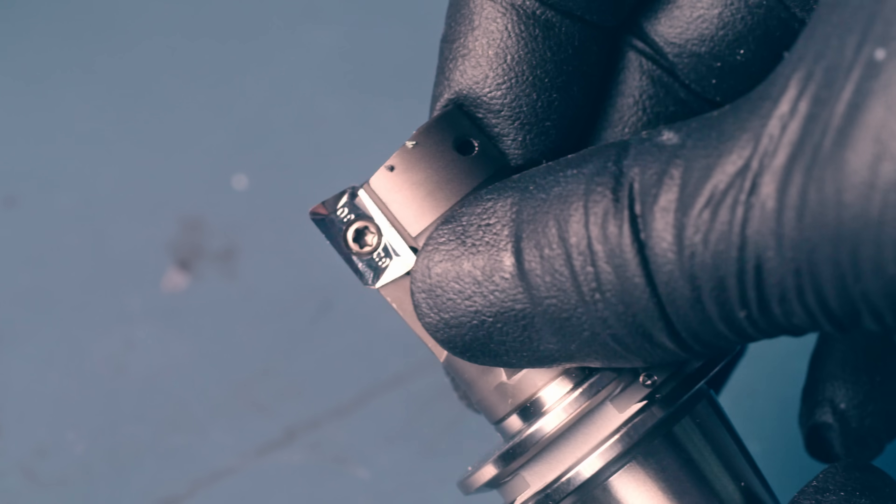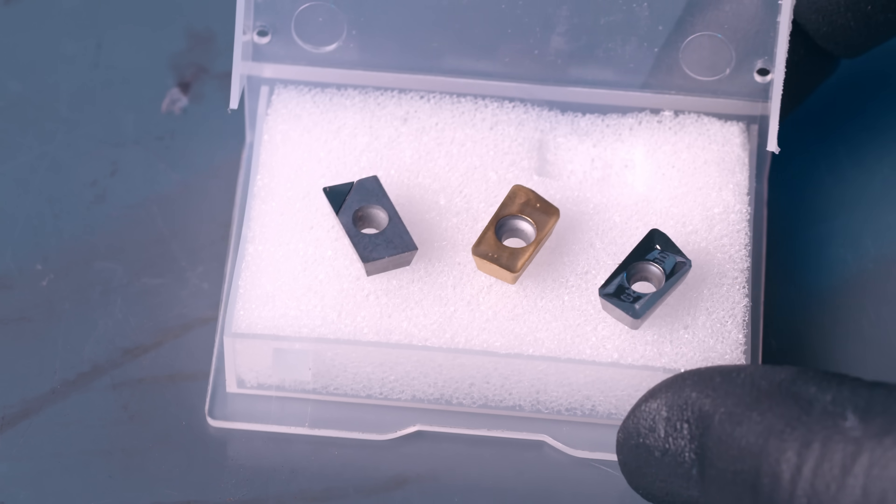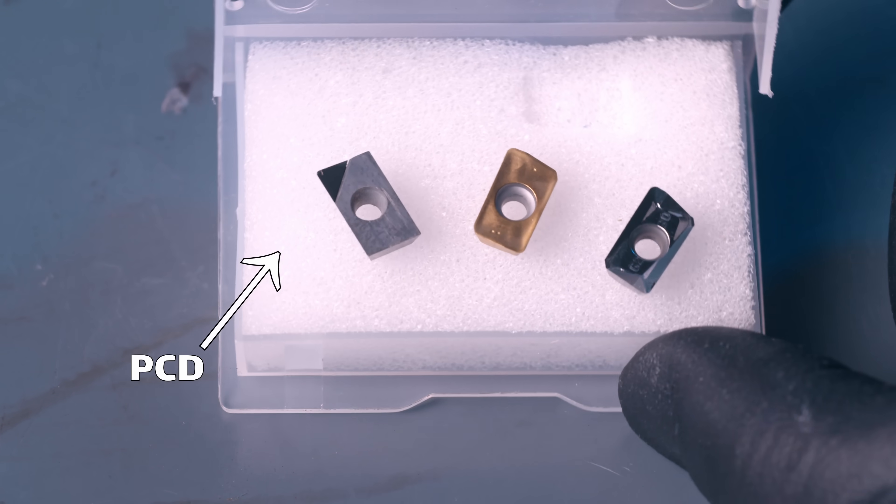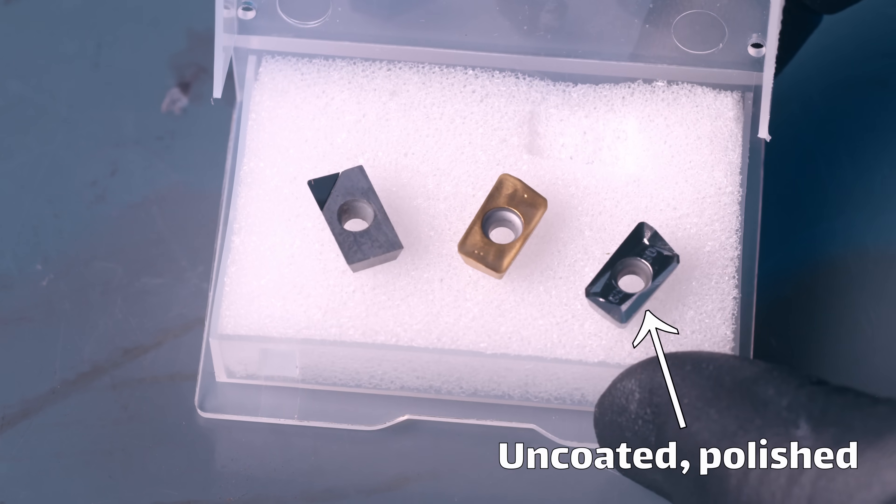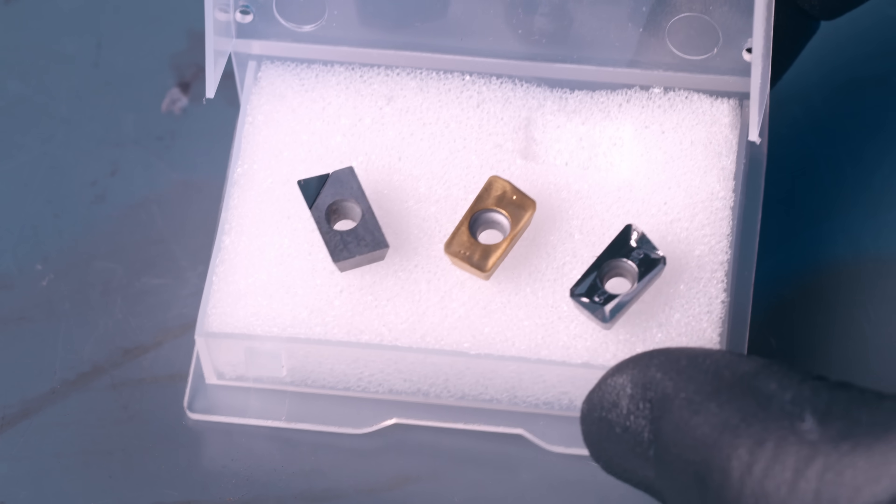Sometimes the carbide is pressed into little shapes called inserts. That's what we're going to use today. These are three different cutting inserts and you can see they all have slightly different shapes and coatings and materials. These little differences can have a big impact on how they actually cut the metal.